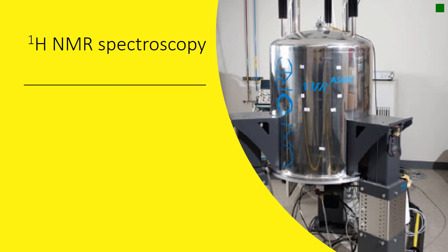Hi, and we're now going to have a look at some more detail about proton spectroscopy. This picture on the right is an NMR spectroscopy machine for proton spectroscopy, for what it's worth, because you can't see much. It looks like a big tank there, doesn't it? But inside the tank is first liquid nitrogen and then liquid helium, and that's to keep the magnets cool, so we've got a strong magnetic field there.